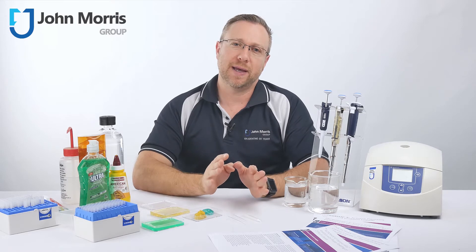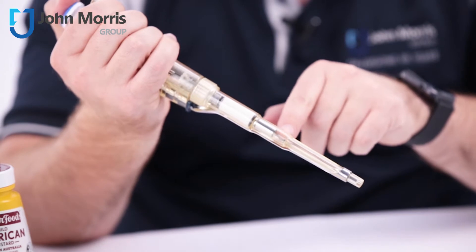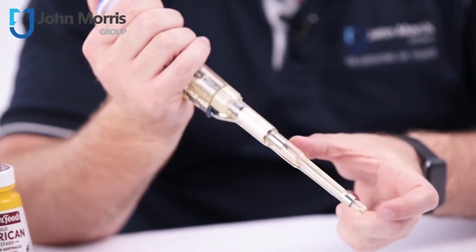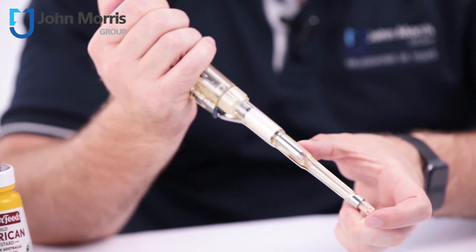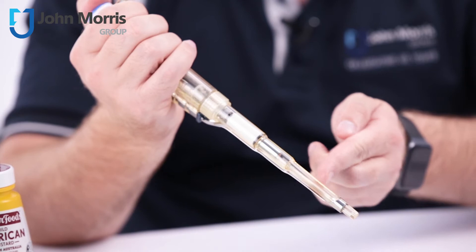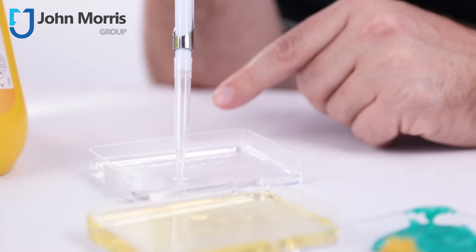Air displacement pipettes such as the Gilson are based on a simple concept. When the push button is pressed, the piston moves the liquid under the action of an air cushion — called dead volume — between the pipette and the liquid sample. The volume of air displaced is equivalent to the volume of liquid aspirated, on the basis that your liquid has a density similar to water and the temperature is similar to room temperature.